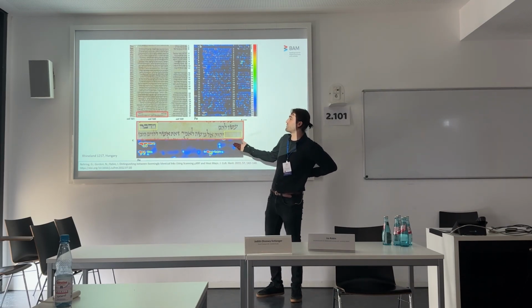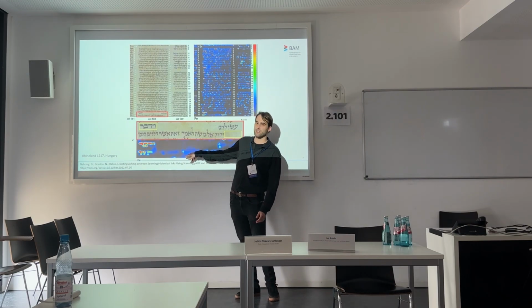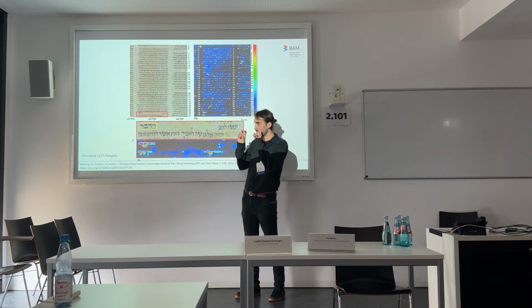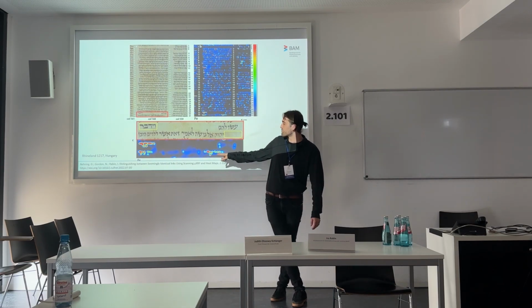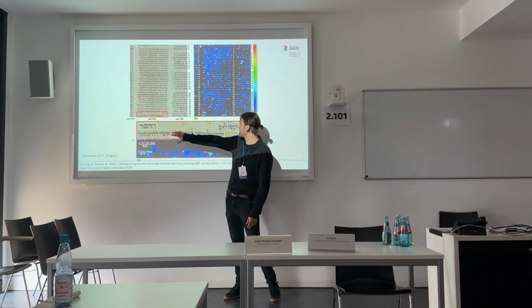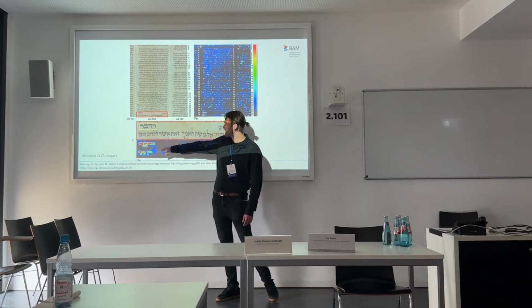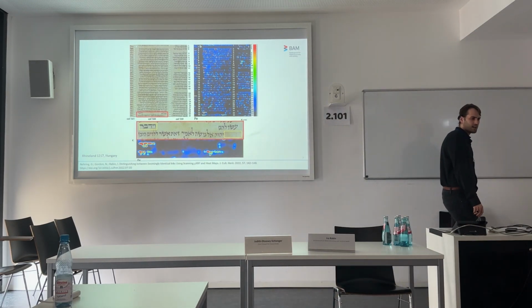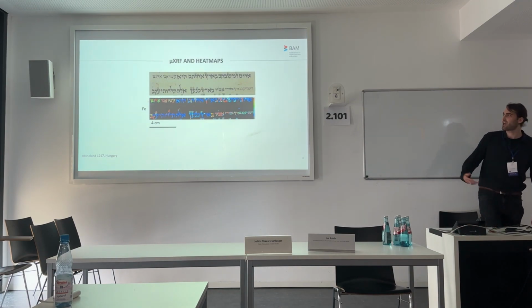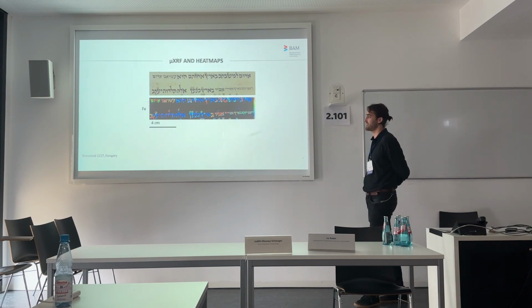also mirrored in the, even though, first of all, this is a lower resolution scan, therefore we cannot read the letters which are here expressed in this black column. However, where the dark blue column, however, where the signal is higher in red, we clearly see how this message has been moved. More than that, we see how some fragments here of the text were corrected in the lowest line.